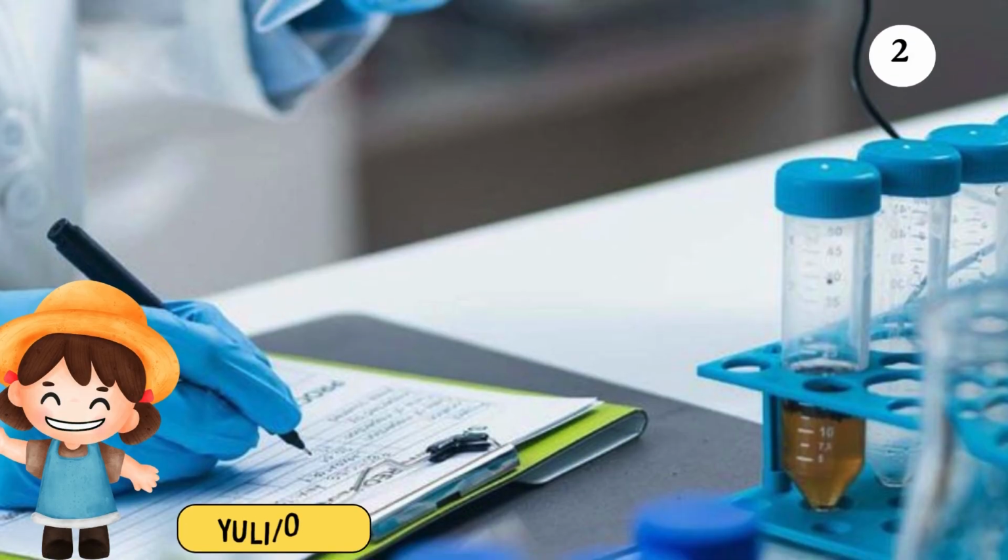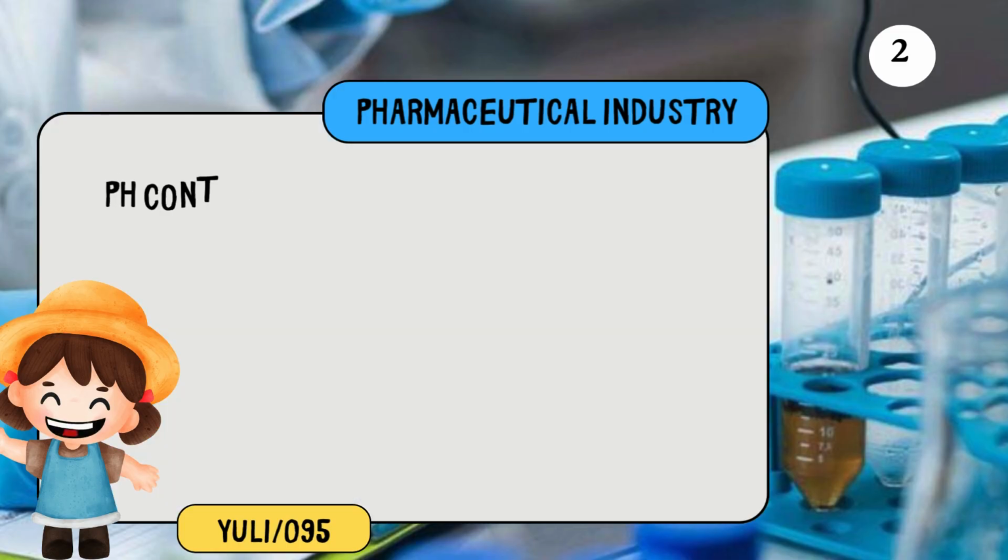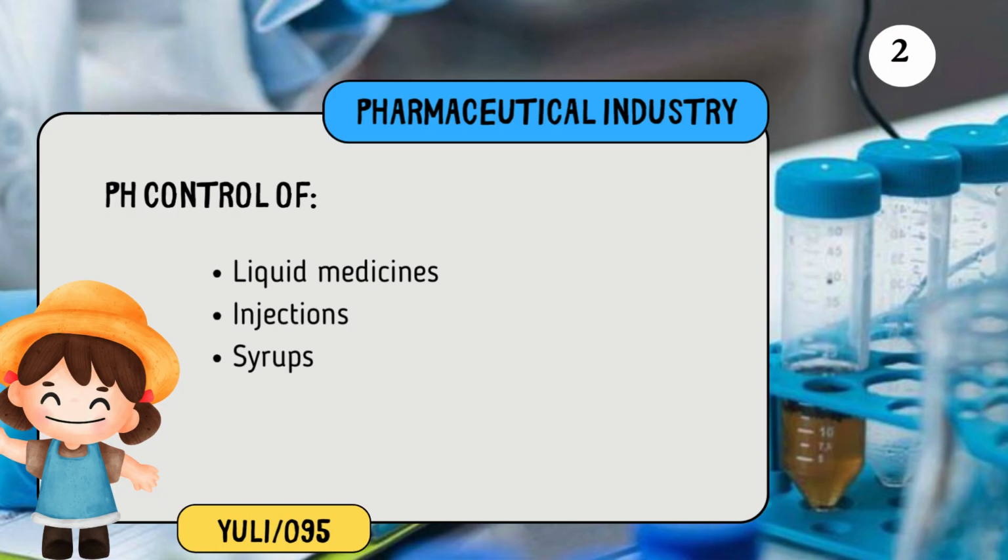And the next is in the pharmaceutical industry. In here, potentiometry plays an important role in controlling the pH of liquid medicines, injections, and syrups.